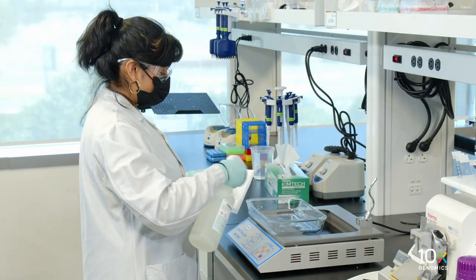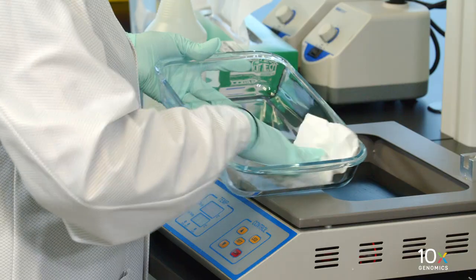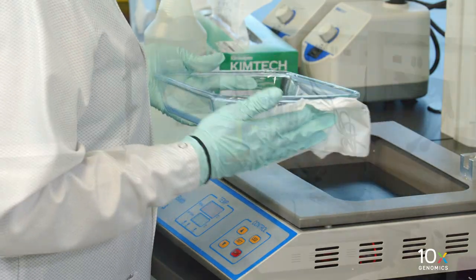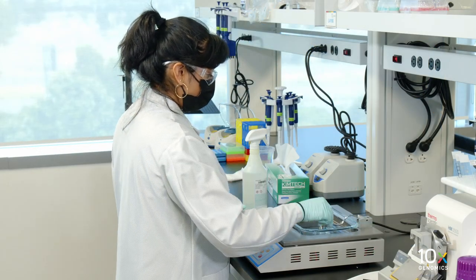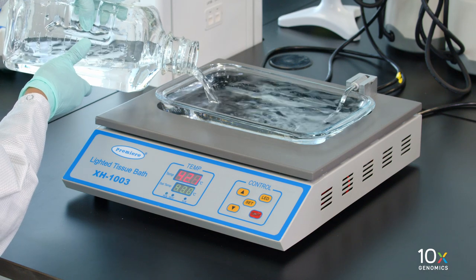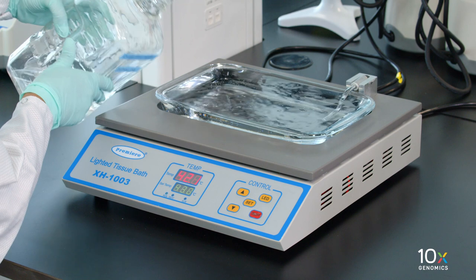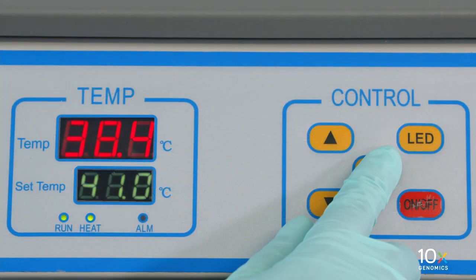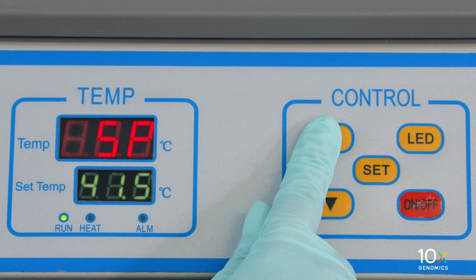We are preparing to collect the tissue sections. First, we will prepare a water bath. Clean with RNase Away before using. Fill the water bath to the brim with RNase-free water. Set the water bath temperature to 42 degrees Celsius and let it stand for at least 30 minutes.